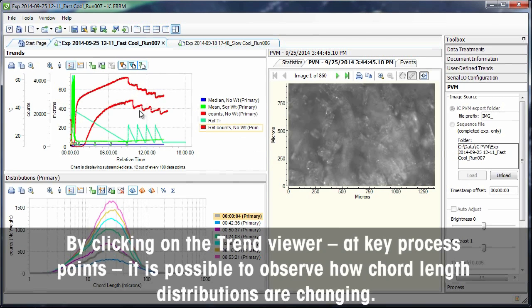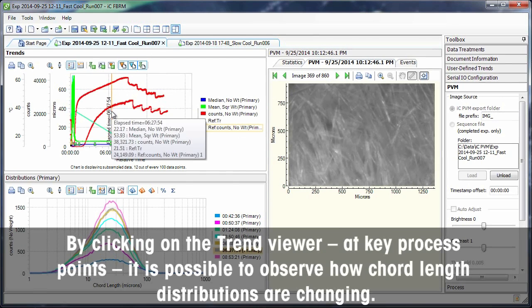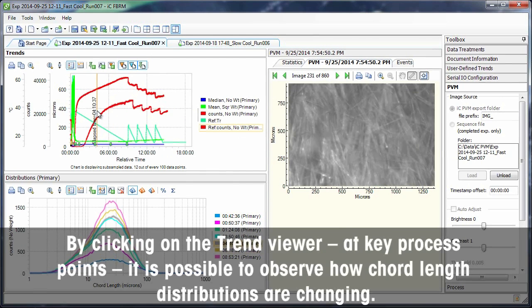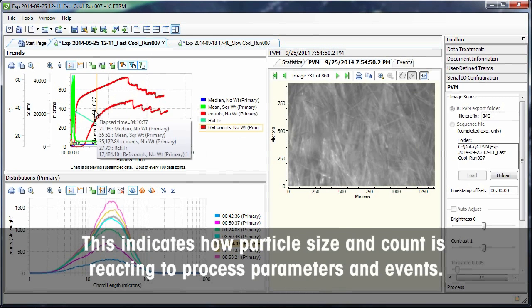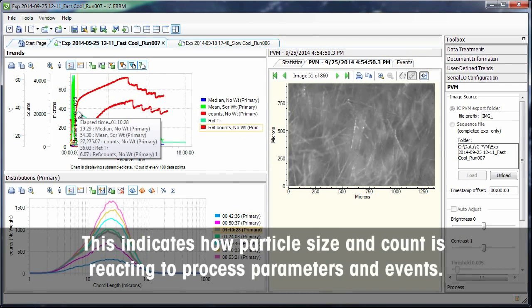By clicking on the Trend Viewer at key process points, it is possible to observe how chord length distributions are changing. This indicates how particle size and count is reacting to process parameters and events.